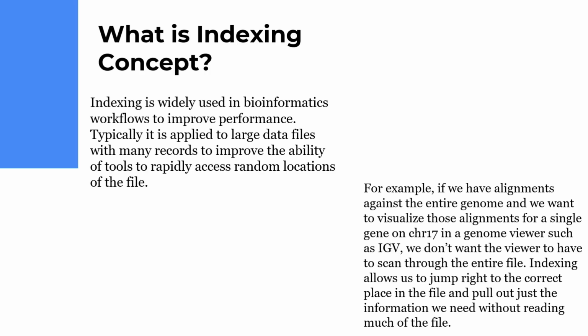For example, in a book that we start to read, there is an index in the first two to three pages. So we can keep an eye on where the main thing is, where the main chapter is, where the second main chapter is, something like that. Now you have got the idea of indexing.